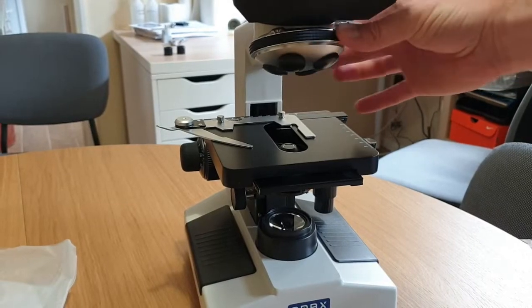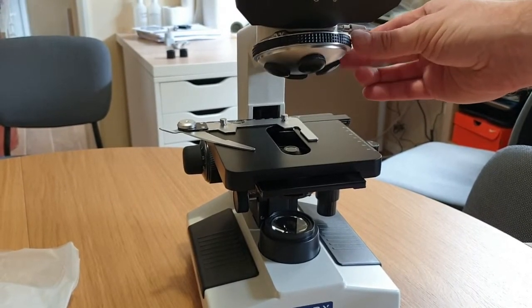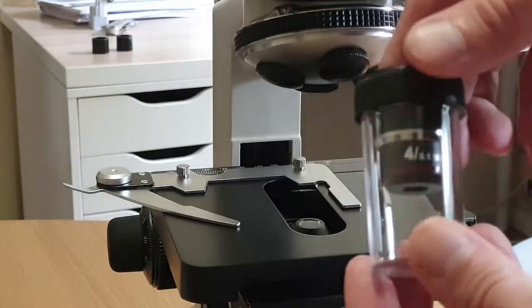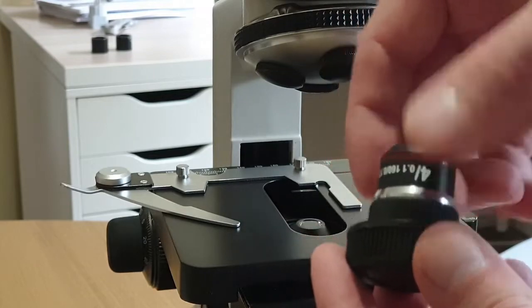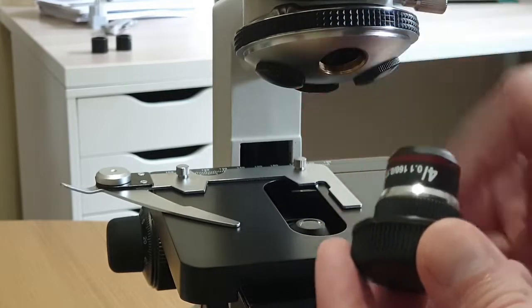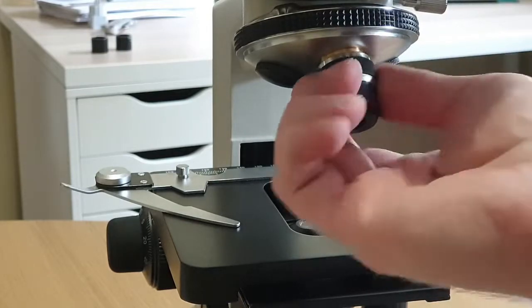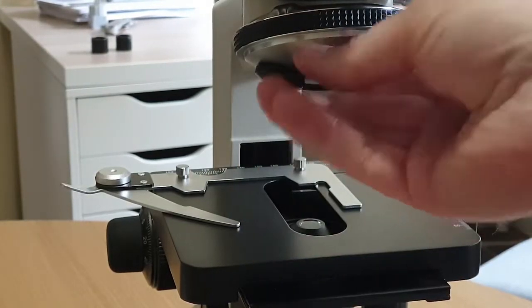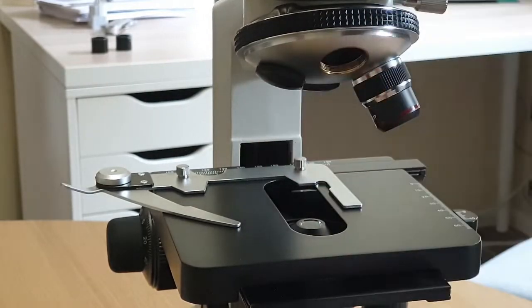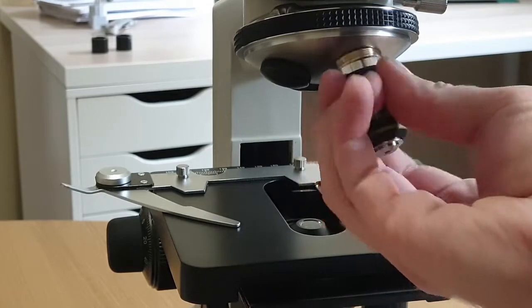The nose piece rotates freely and gently locks in every location with a satisfying click. It does not matter which slot we start with. First the 4x objective goes in. The threads have a tight pitch so take your time to align them in order to avoid damage and frustration. You don't need excessive force when tightening — finger tight is enough for them to sit accurately and securely. We do the same with the 10x and 40x objectives. Again we skip the 100x objective.